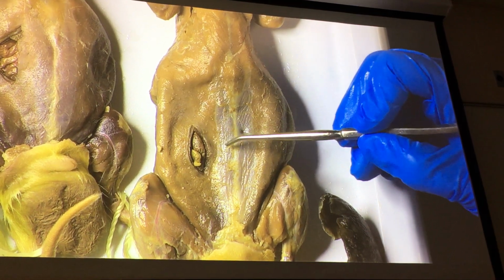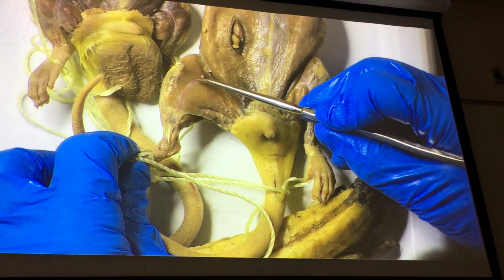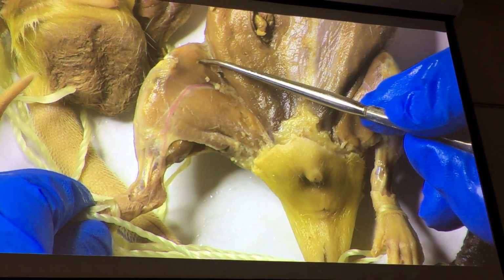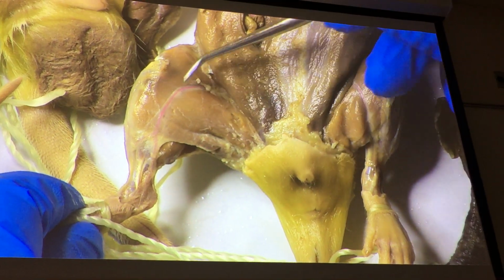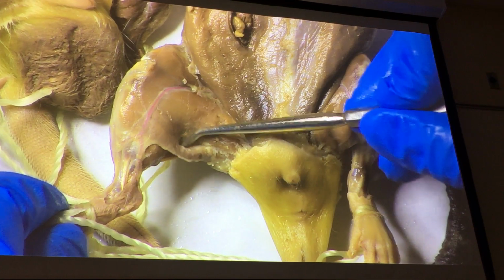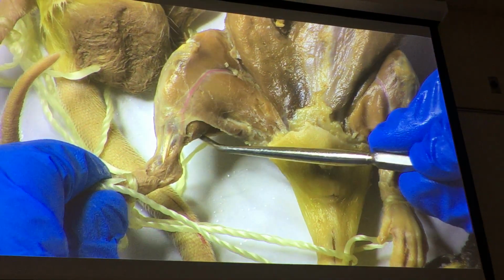All right, then we get to the thigh. And there's not a lot on ventral thigh because we didn't go through the muscles. But the muscle above the femoral artery and vein, gluteus superficialis again, right? Then we're going to have our gracilis. And a lot of these animals, we can see the semitendinosus. And then right there, gastrocnemius.